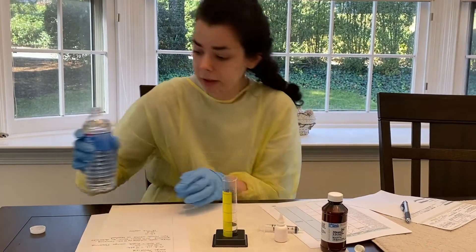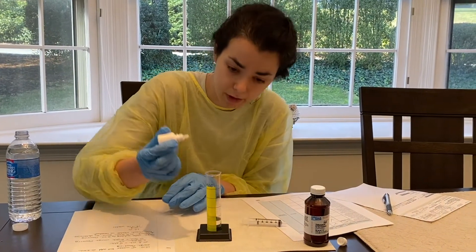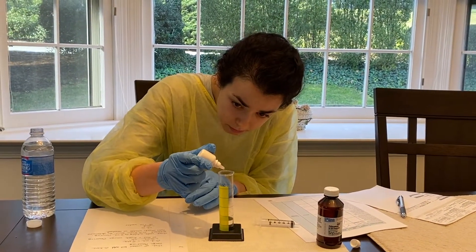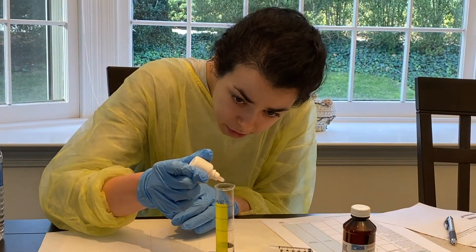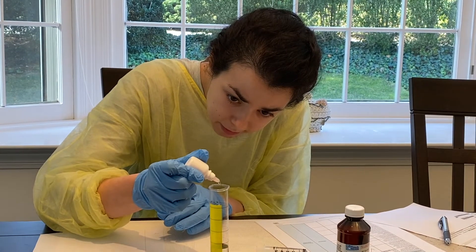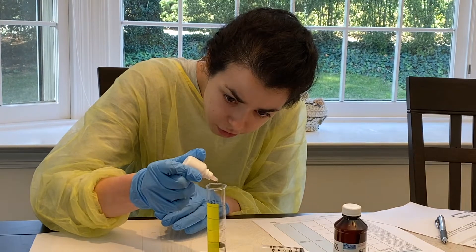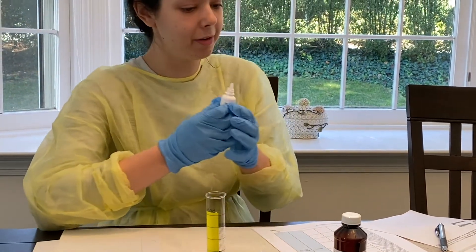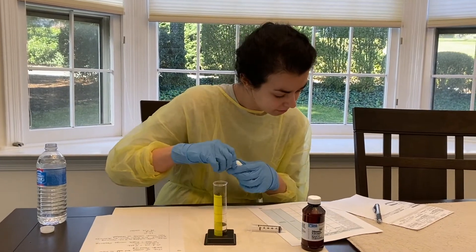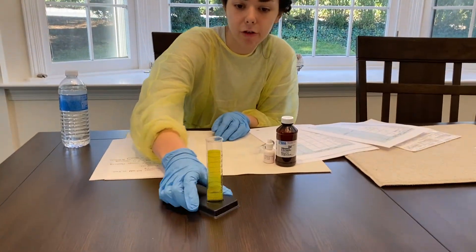Now I'll be adding in my six drops of orange flavoring, so we're going to count: one, two, three, four, five, and six. That should equal 15 milliliters, and this is what it should look like.